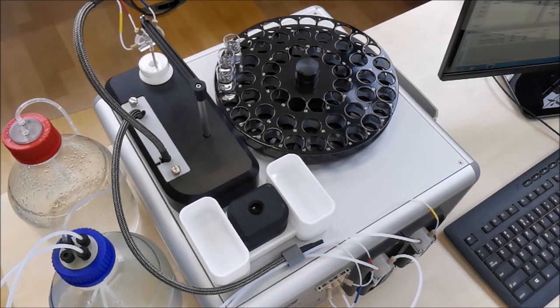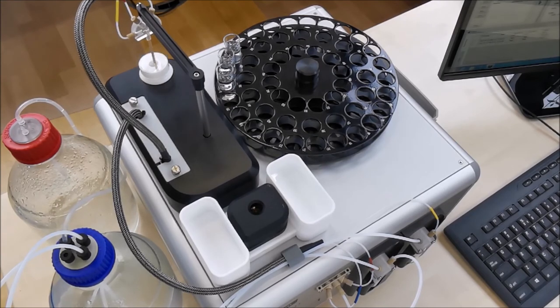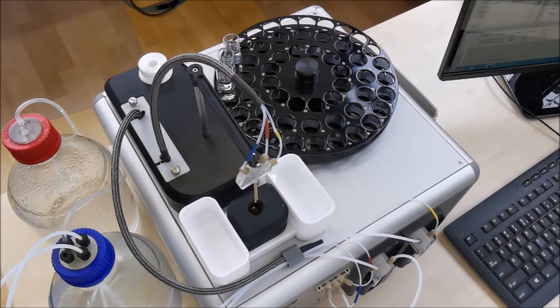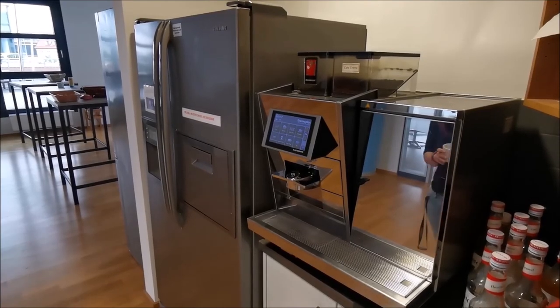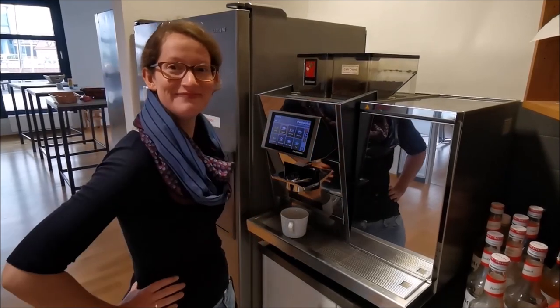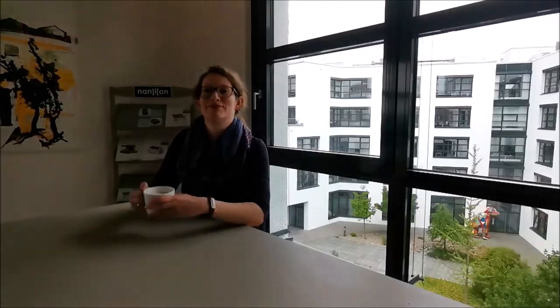From this perspective, you can also observe the electrode pin used for the grounding within the measurement chamber. Since the instrument works fully automated, this is the time for a break. Let's have a coffee. Or call it a day. And get back on the next day for data analysis.